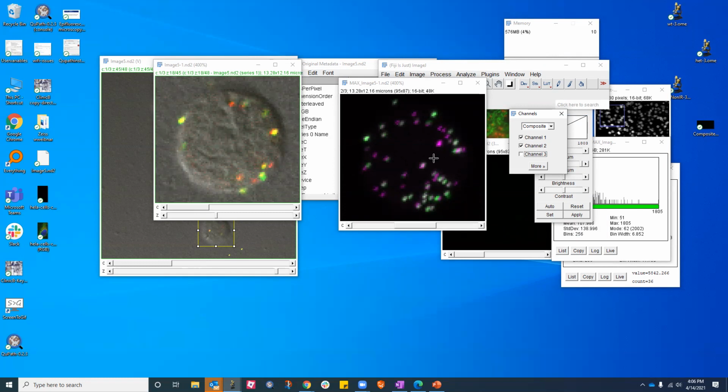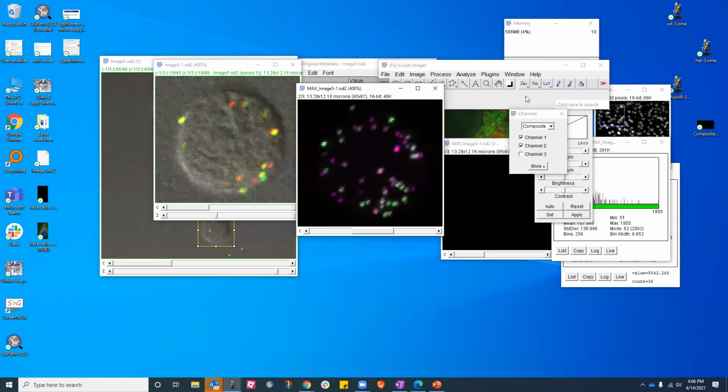Right. Okay, so you can try to play with this by yourself. All right, so we got this right here. It's already 4 o'clock. Shoot. So we got this right here, and let's say one last thing I want to show to you.